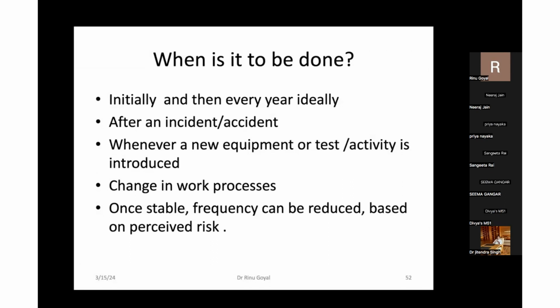Now the question is, when is it to be done? There are so many risk areas in the laboratory. When we start thinking about that, the mind gets puzzled. So many things to do, how to do, when to do. There are a few helps which we can learn. Whenever we are going to start a laboratory or a process or activity, it is to be done. If some incident or accident has happened, we have to assess that. Whenever there is new equipment, as Dr. Neeraj sir has told, verification of equipment is to be done, IQ, OQ, PQ is to be done. So again, it is a risk management activity.